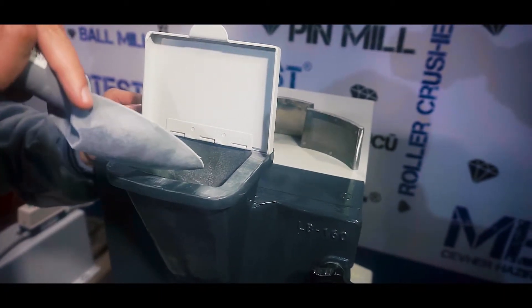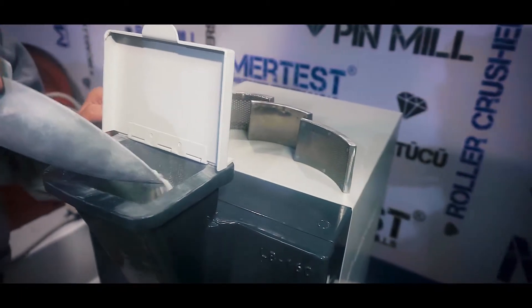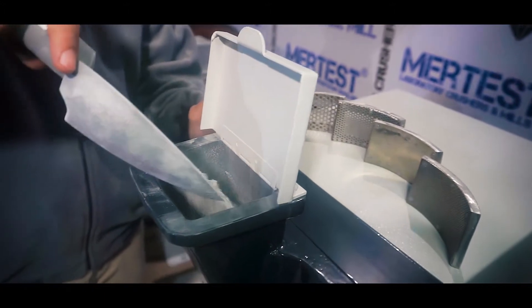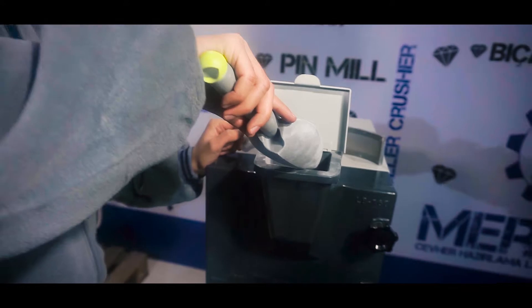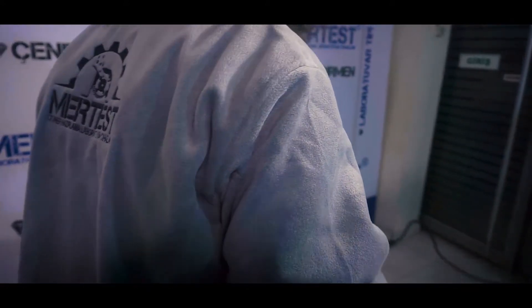We start feeding material slowly to the mill. The size of the material is approximately 10 mm. The ground material is collected in the product collection container at the bottom of the machine. The machine is stopped by pressing the stop button after grinding.